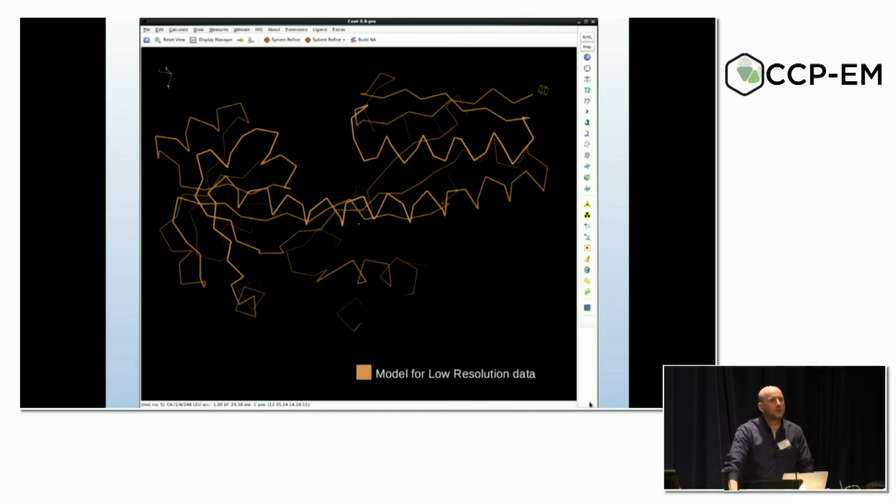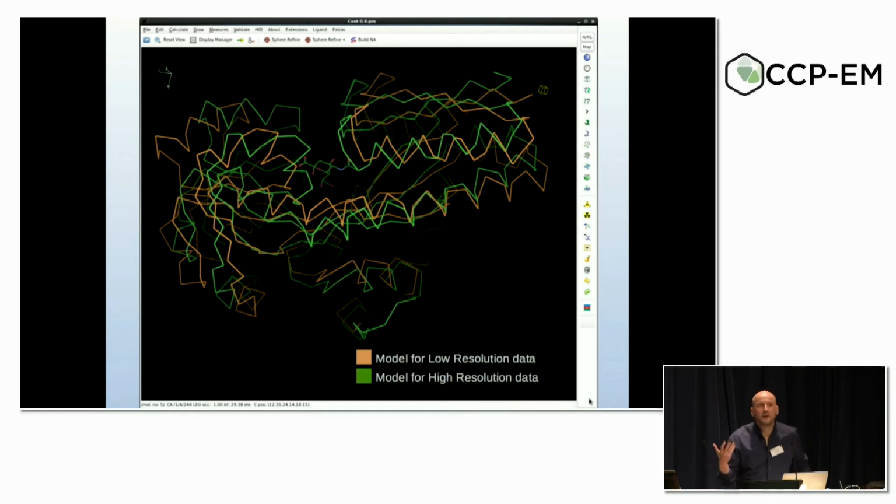So, for example, we've solved a molecular replacement problem at low resolution, and this is the apo form. Last year, we solved the structure of the holo form containing the carbohydrate. It has the ligand bound, and not unsurprisingly, this diffracts to a high resolution. What we want to do is take the information from the high resolution structure in a local fashion and apply that prior knowledge, expressed in terms of local distances, to stabilize the refinement of the model using the low resolution data.